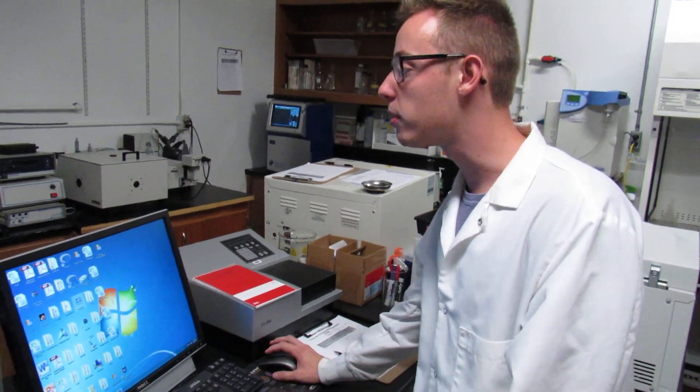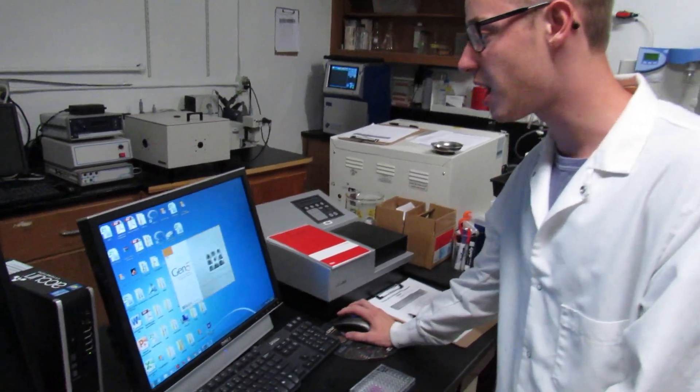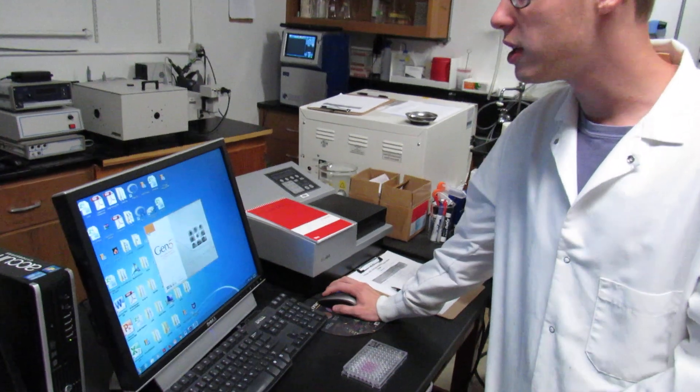Good afternoon. Today I'm going to show you how to run an XTT assay. To begin, you're going to want to set the parameters on the 96-well plate for the plate reading spectrophotometer.